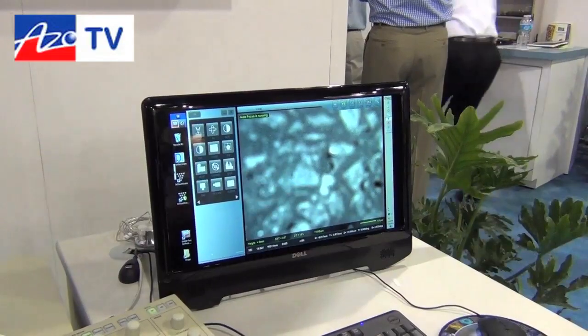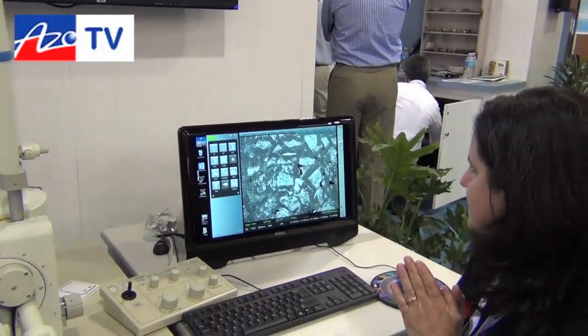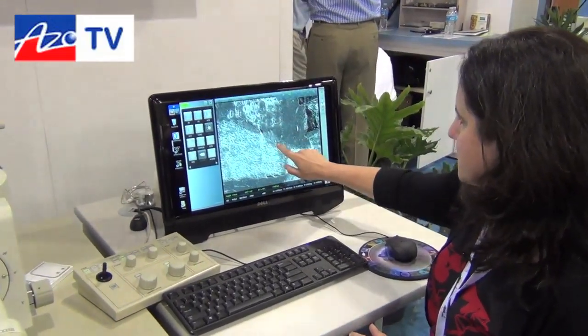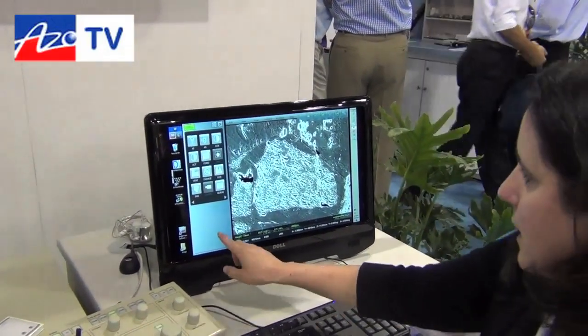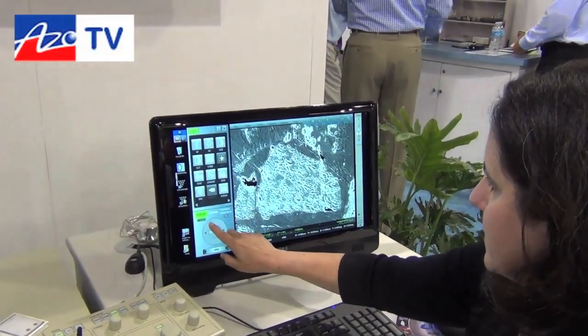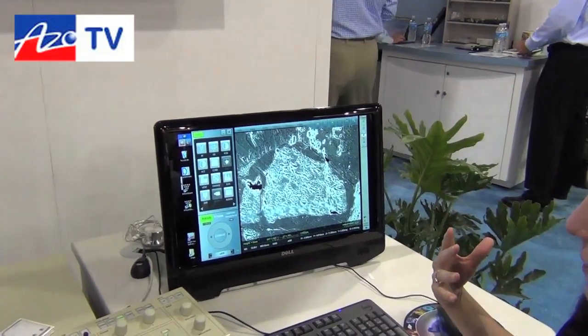I can automatically adjust the brightness and contrast, zoom in, and ask it to focus for me. I am looking at a geological thin section. If I want to adjust focus in any way, I can do this manually as well as using the auto features.